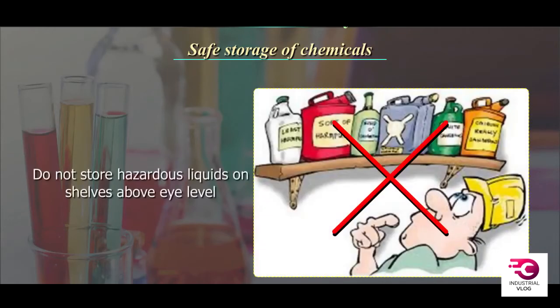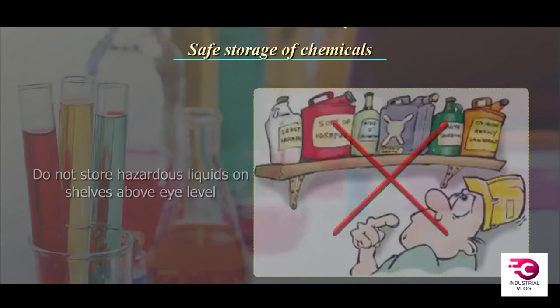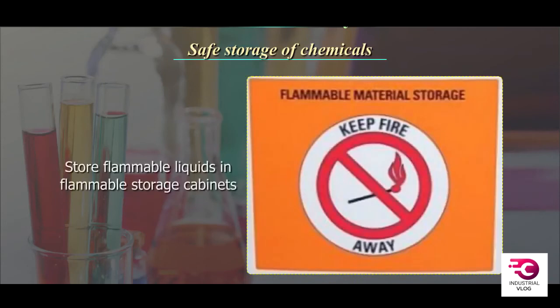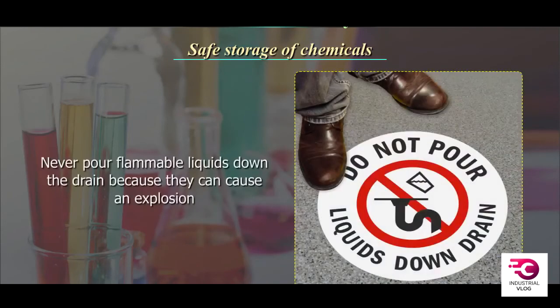Do not store hazardous liquids on shelves above eye level. Place the solvents requiring refrigeration in special flammable storage refrigerators. Store flammable liquids in flammable storage cabinets. Never pour flammable liquids down the drain because they can cause an explosion.